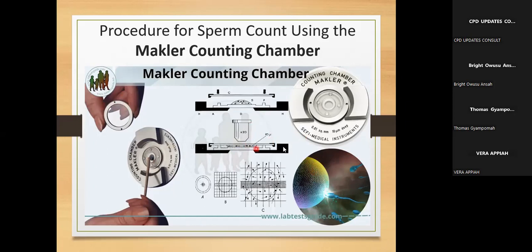Here, the microscope, you know, this one is a big thing. You see how the nature of this one is very, very big. So if you use the 40, the high power objective, it will not work. You know that. You know what is called working distance in the microscope. Another microscope. Now, the distance between the slide, if this is your slide, okay, and then this is your objective. If you focus, the distance between the slide and then the objective is what we call the working distance.